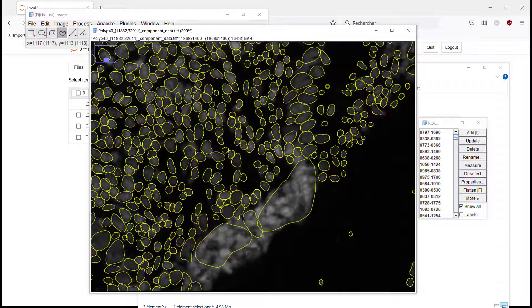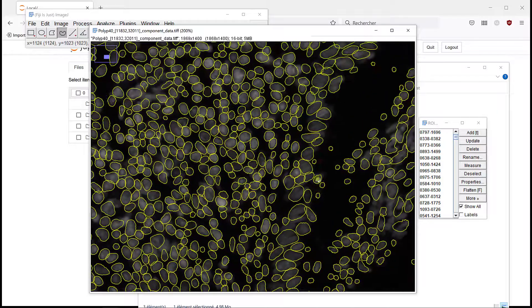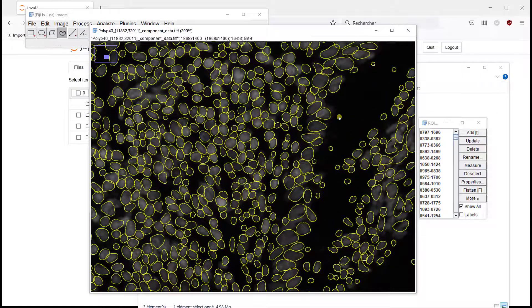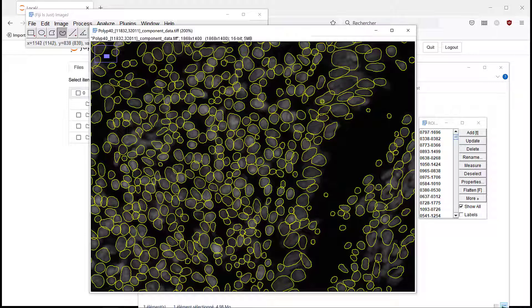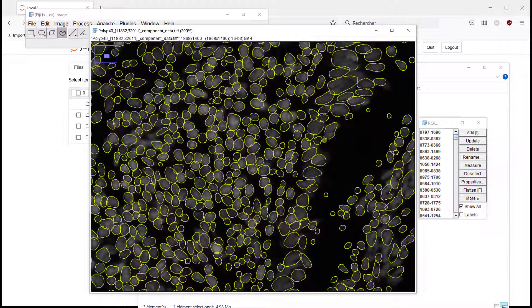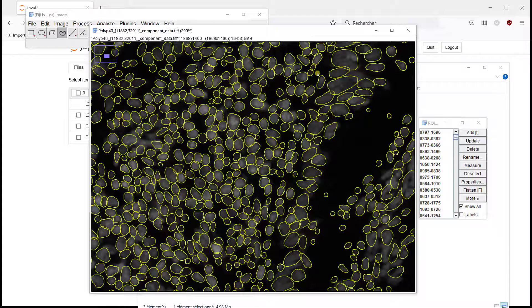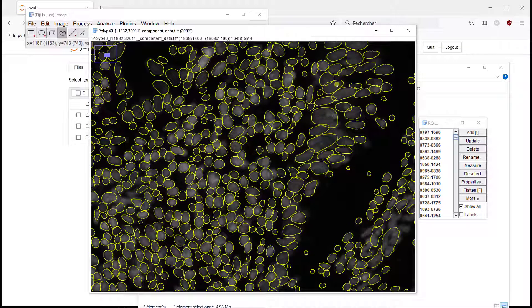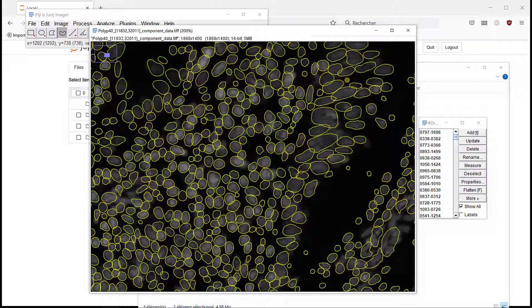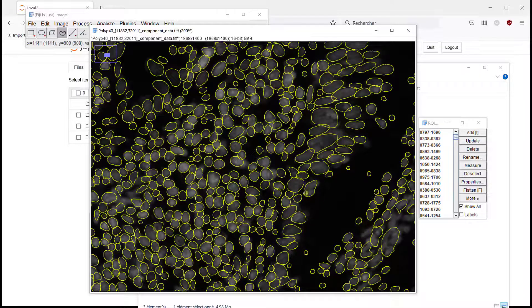And if we look at the epithelial cells, it tends to under-segment and to group them together to have some nuclei that have a roundish shape, and it doesn't really manage to extract the actual epithelial morphology when it's like this.